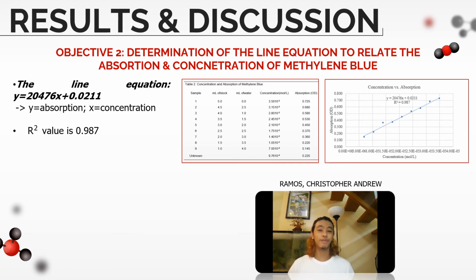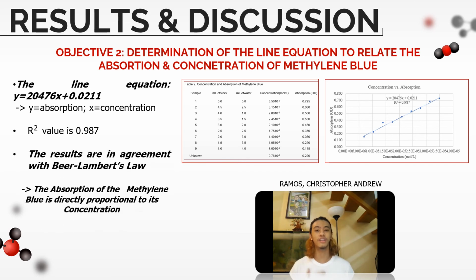This directly proportional relationship between the concentration and the absorbance of the solution is actually in agreement with the Beer-Lambert's law that was discussed a while ago, which states that the absorbance of a solution is directly proportional to its concentration.